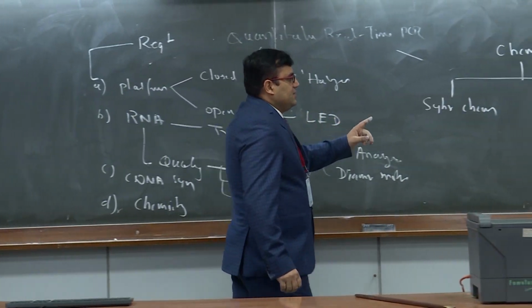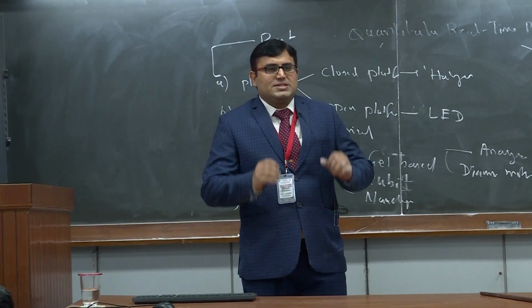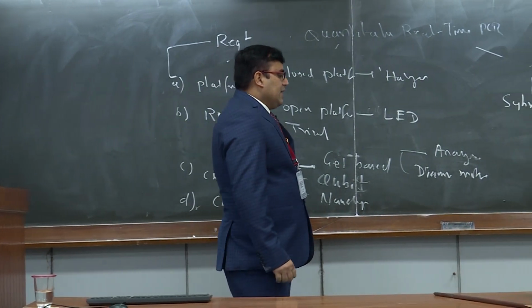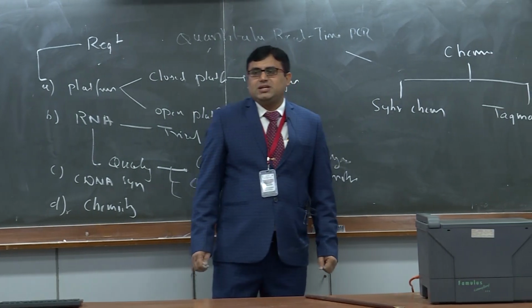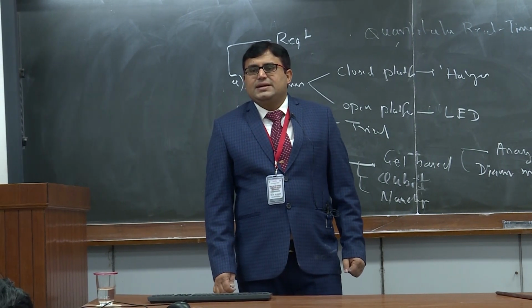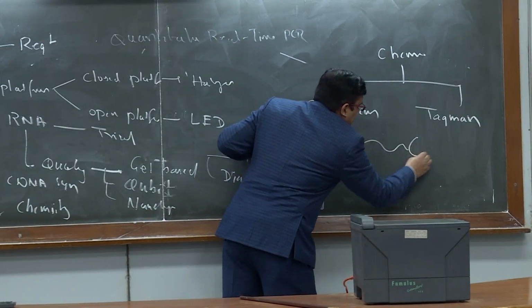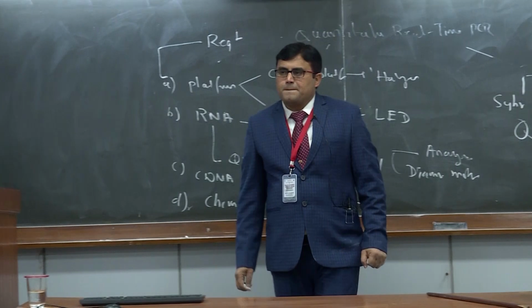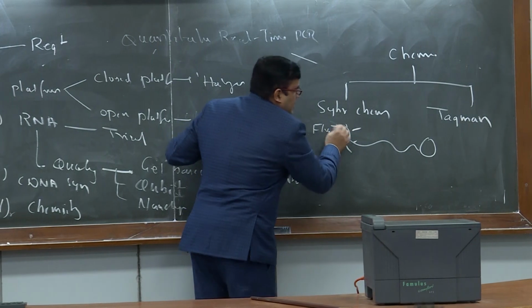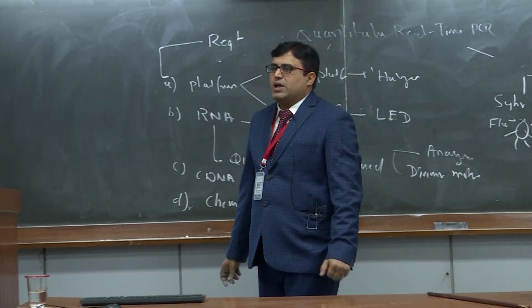But in case of TaqMan, other than the forward and reverse primer, we are also going to use a specific sequence which hybridizes with the gene, and it has a specific endpoint, with a fluorophore and a quencher.